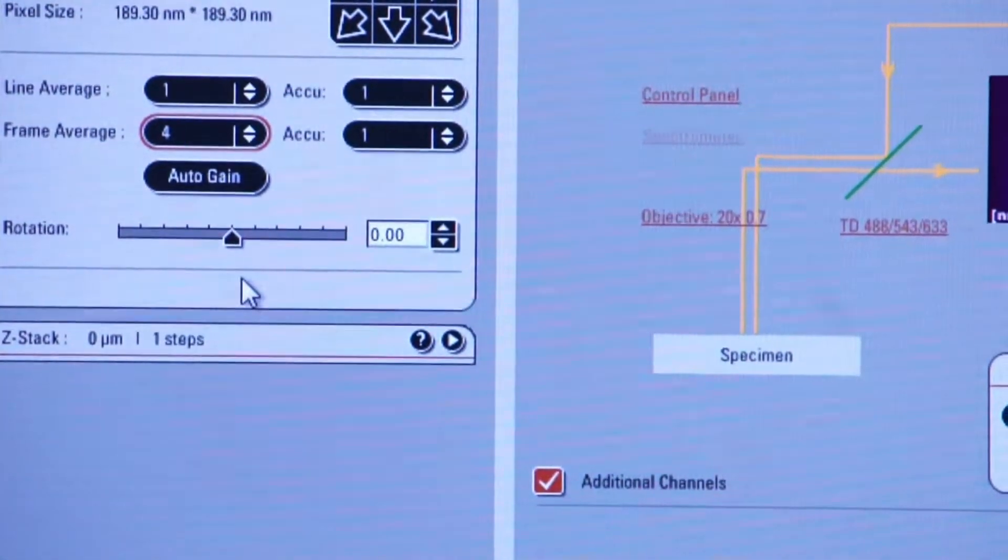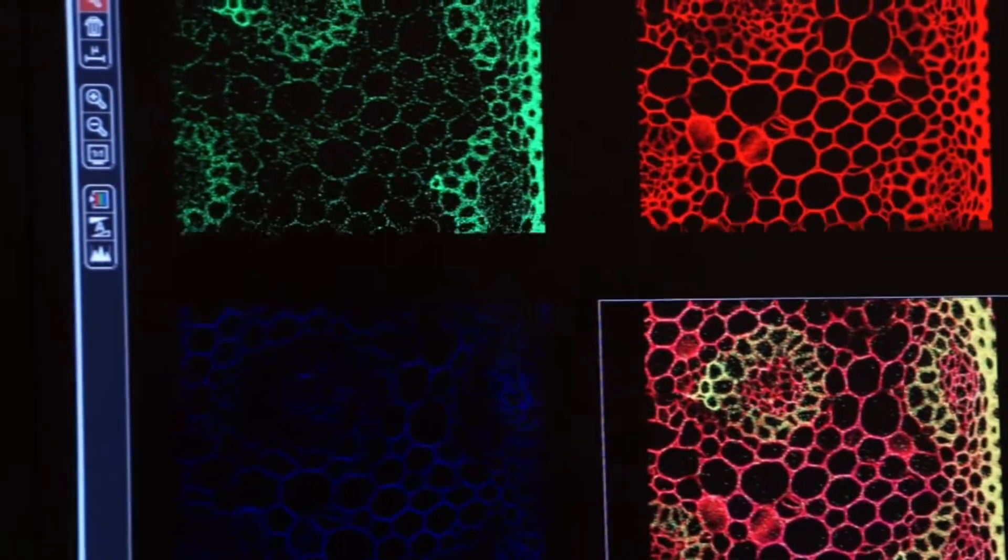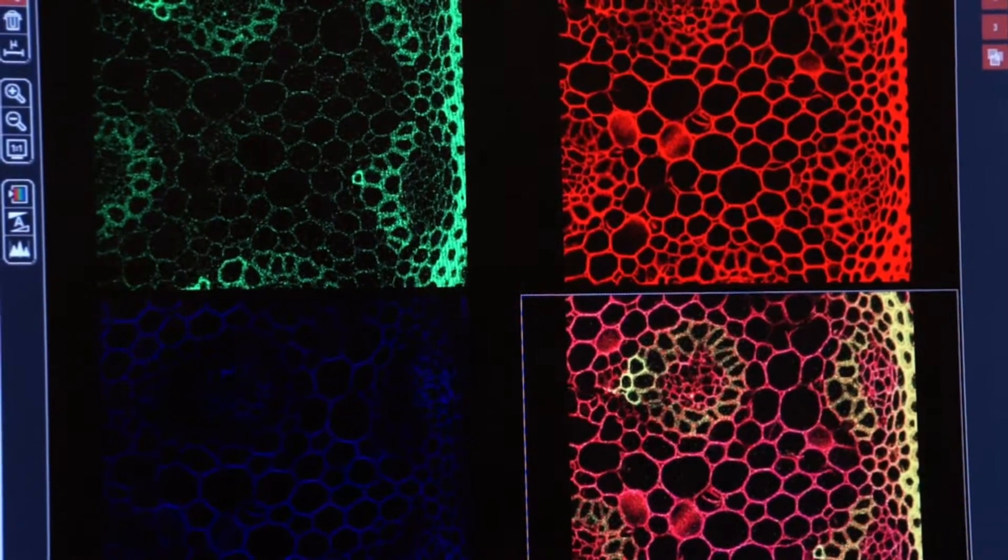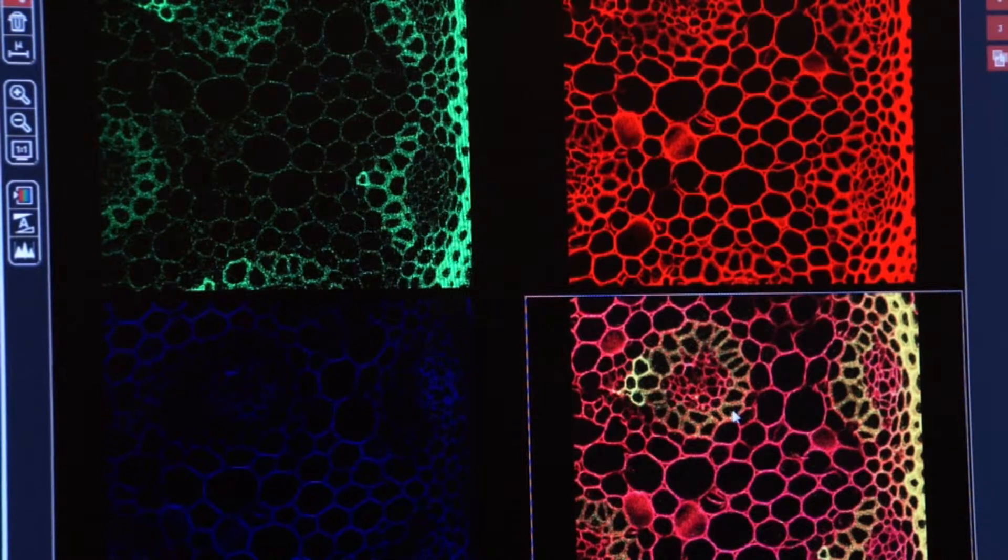Now we're going to click on capture image and watch the image on the right screen. This is a little faster. Again, frame averaging is always faster than line averaging, but it doesn't return as nice a result.